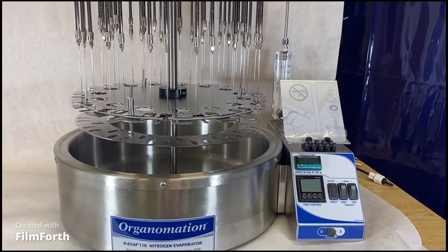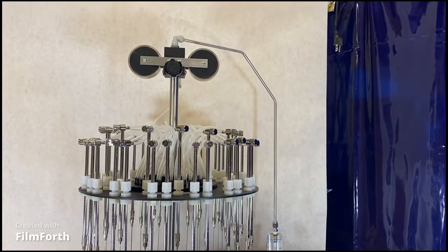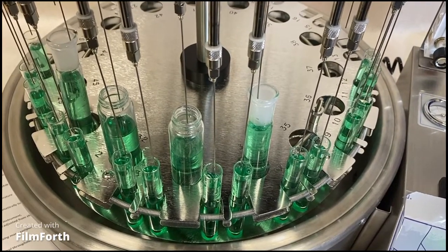Organimation is a leading manufacturer of nitrogen blowdown evaporators for sample preparation and analysis. Our blowdown evaporators are designed to be connected to either nitrogen gas or compressed air.